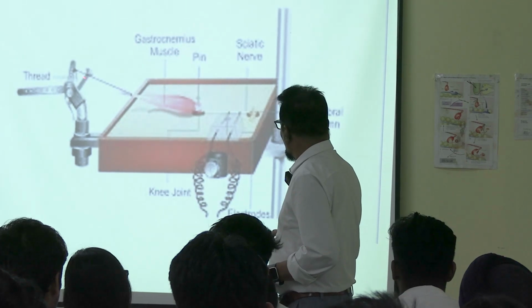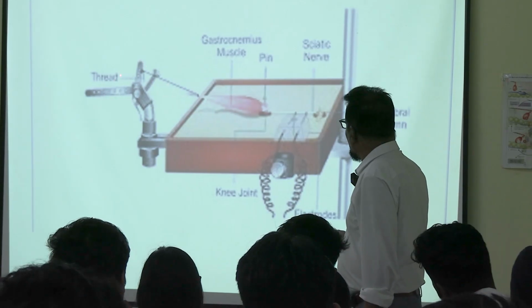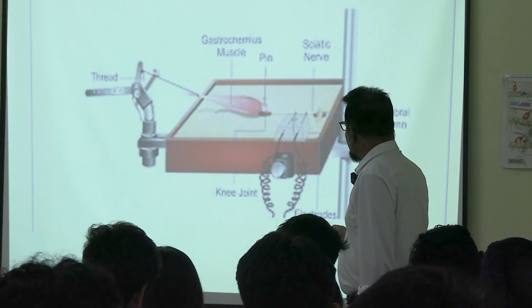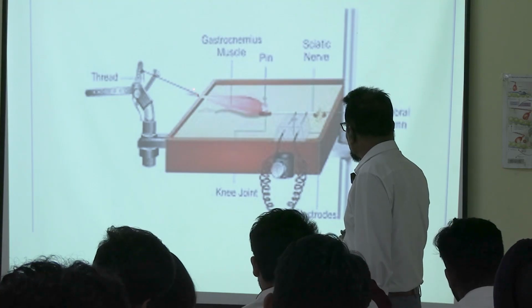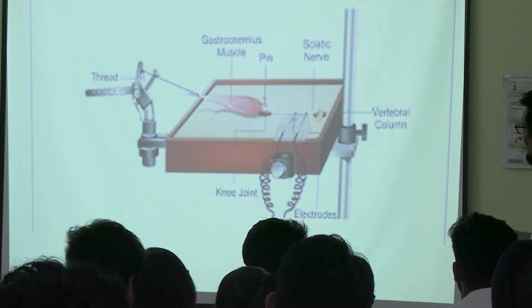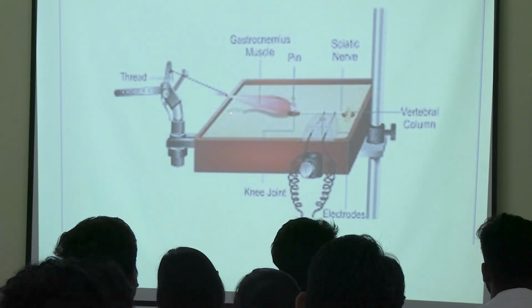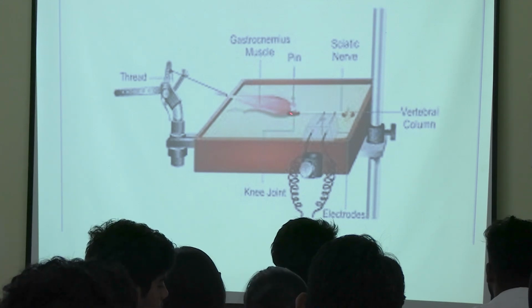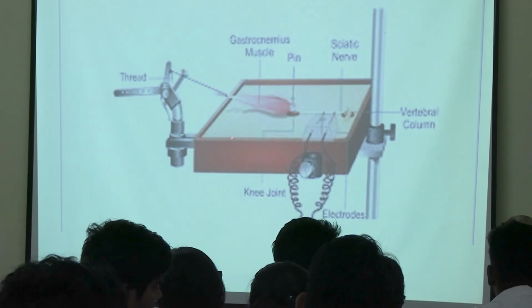Okay. Now, what has to be done? This is the tendon. So this is the lever, short arm, long arm. There is a thread, and at the other end there is a hook. I will pierce the hook through the tendon. This is now obliquely active. It is not resting on the surface. Only the knee joint will be touching this.